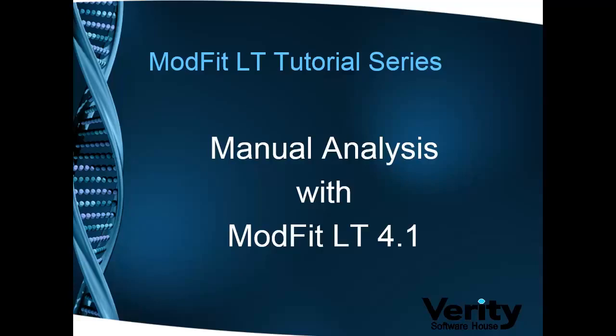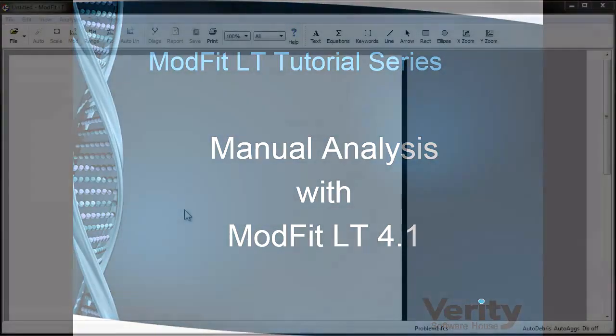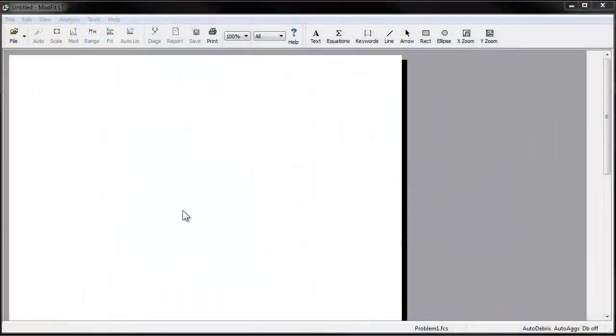you need to position ranges over important peaks, choose a few options, and finally tell the program to analyze the sample. Let's get started.